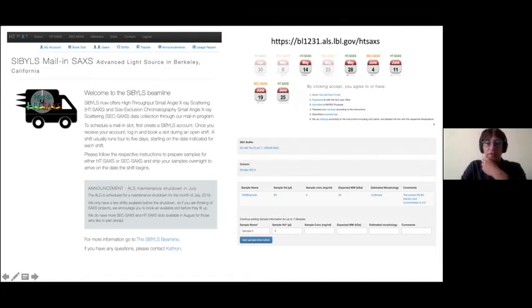And the spreadsheet is not just to bother you with information, but it's very important, especially the buffer, just in case the buffer is not delivered. We have the capability to prepare 10x buffer, 50 mL for you, but we would rather receive the buffers from you. You choose the column. This is very important. We have 3 columns, 803, 802, and 804 SHORT-X, and all the information on what kind of size separation you can expect from these columns is in the instructions.